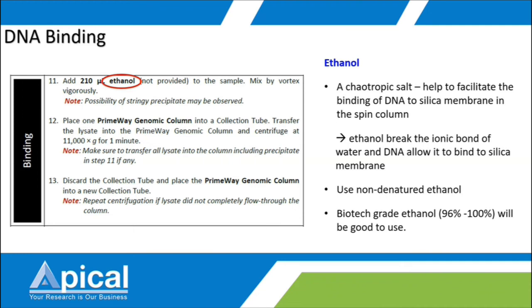Because commercial kit makers will have difficulty in shipment of the kit and also in getting the license if they include the ethanol inside. So most of the kits won't have the ethanol.